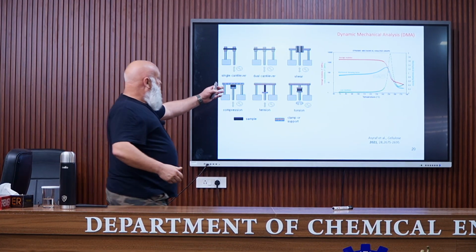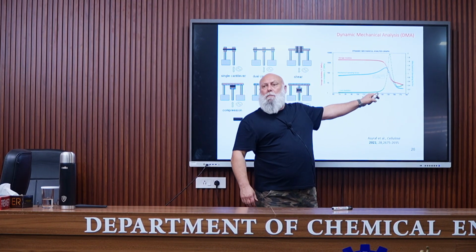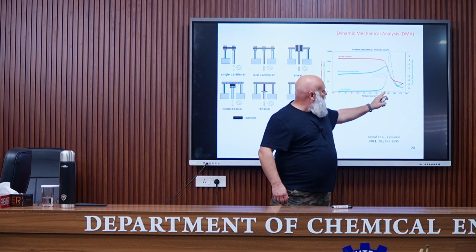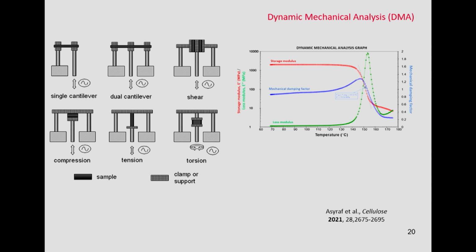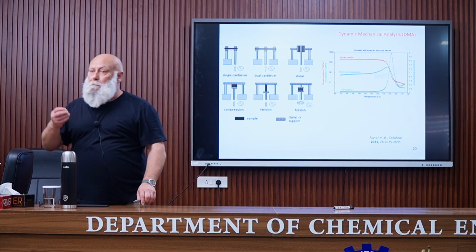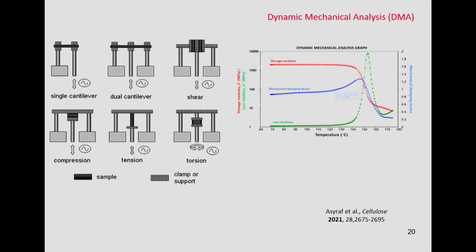From this experiment, we know that, for example, if this curve has been obtained at 1 Hertz, this material, when it is at 145 degrees, will have a maximum absorption for frequencies of 1 Hertz. And so damping properties of polymers are important for many applications. So I cannot say that DMA is better than the tensile test. It's different information. Okay? Thank you.